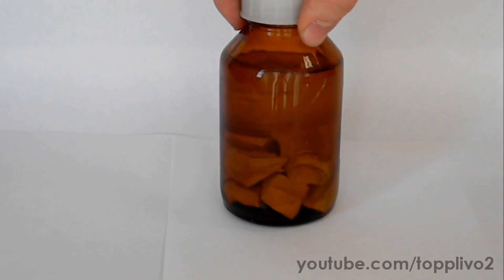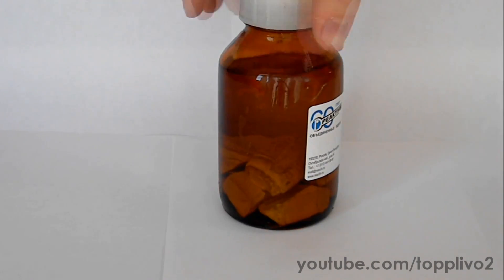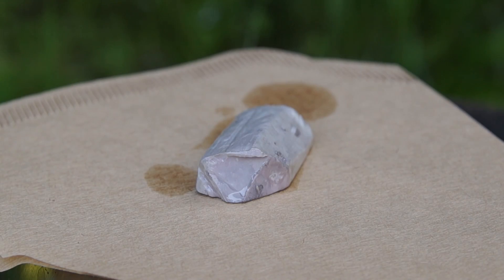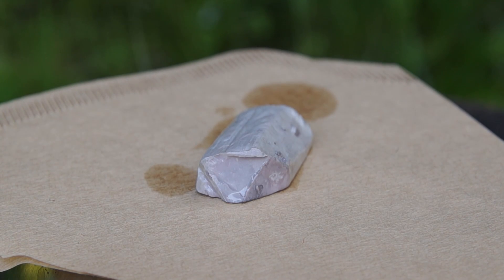As you can see, sodium is stored in kerosene in a jar. We need to take a piece of sodium and put it on filter paper to soak up the remaining kerosene.